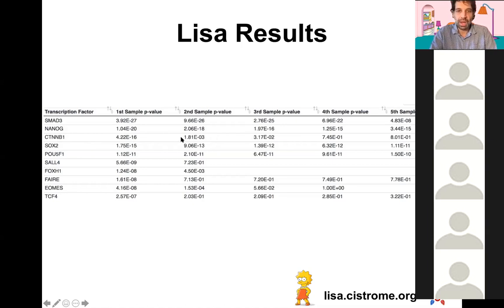And then you might be interested to know more. You can click on this sample and look in the inspector and find out more about what exactly that sample is. It could be that there's a misannotation and it happens not to be beta-catenin, or it could be something interesting. Sometimes if you go into the details, it's a very particular experimental condition or something very special about that.